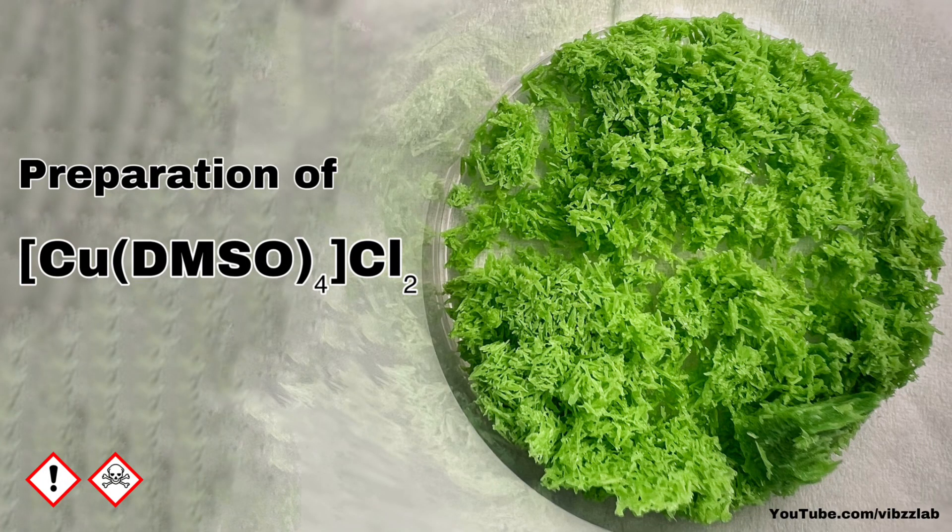Hello friends, in this video we will synthesize the complex of copper with dimethyl sulfoxide. This is a fairly straightforward reaction.